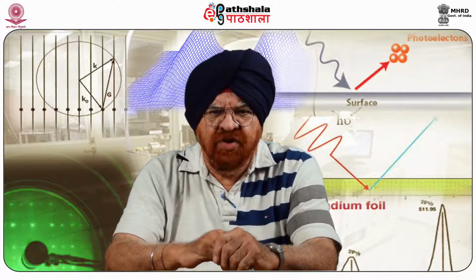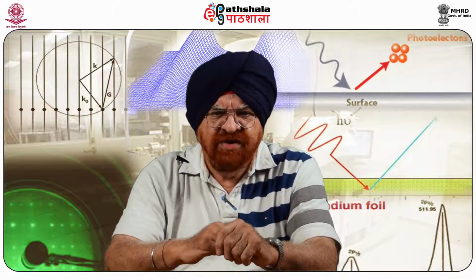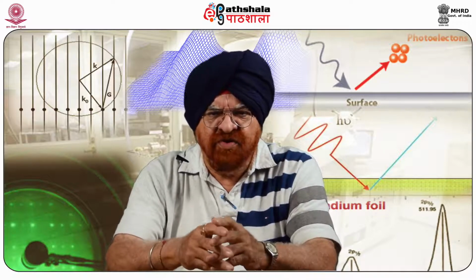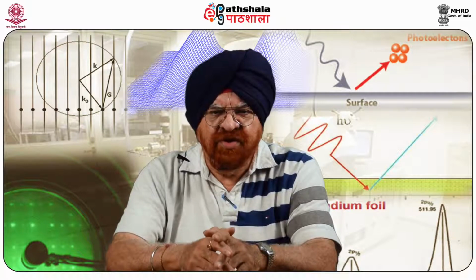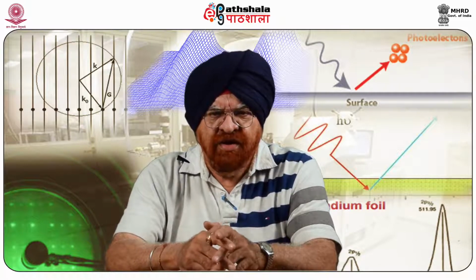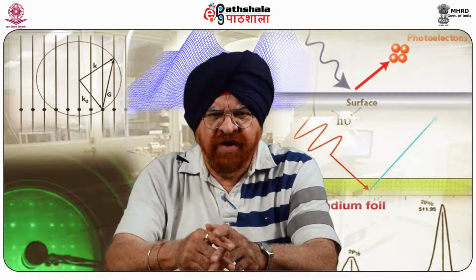XPS is also known as ESCA, as I said in the earlier slide, an abbreviation for electron spectroscopy for chemical analysis, introduced by Kai Siegbahn and his research group.